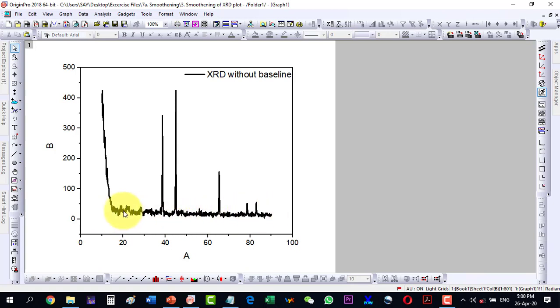And then we can see that it is almost correct with respect to the baseline except at this portion.